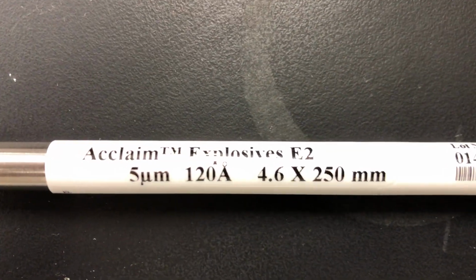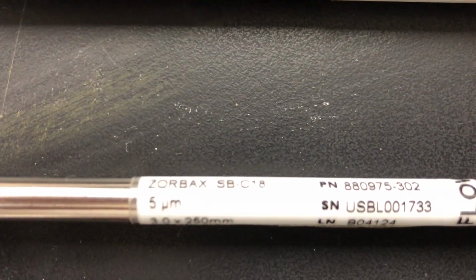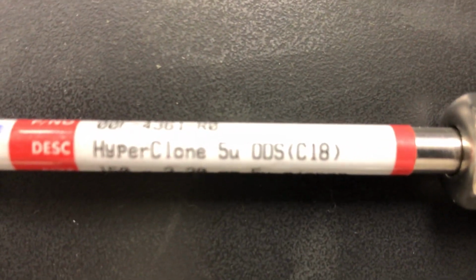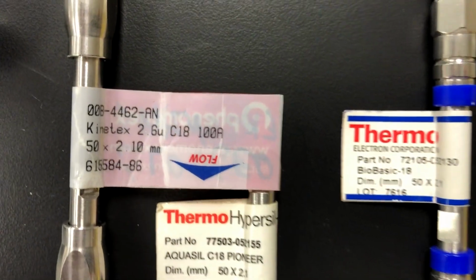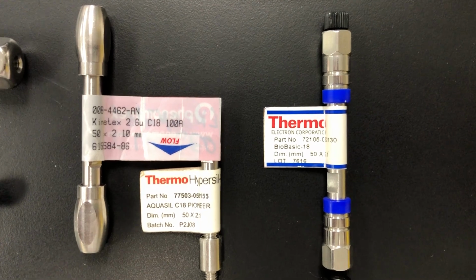It's 100 millimeters. Here we have a specific explosives column. So if you look at each of these labels, it's going to tell you a little bit about the chemistry of the column. It's going to tell you how long it is, what the inner diameter is, and the size of the particles, because these are the critical parameters for these columns. These are a little bit smaller, but they can still do pretty remarkable separations.